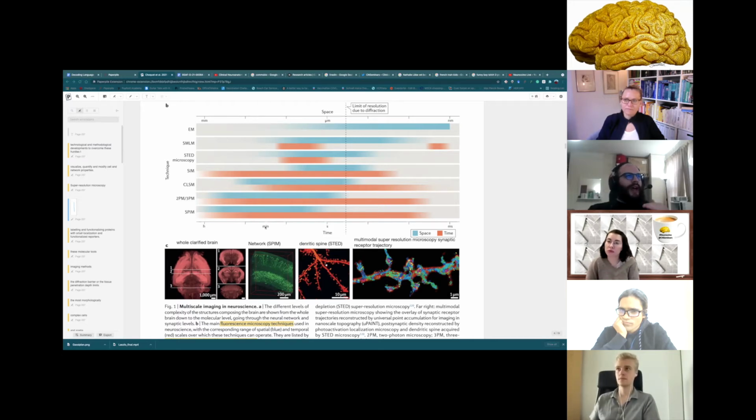So you will only have like 20 voxels, or sometimes even less, in one axis. And with the super resolution and another modality, you can fill up the missing slices. So then you can have a much better image, a reconstructed image. Then you can use it for more accurate analysis after that.